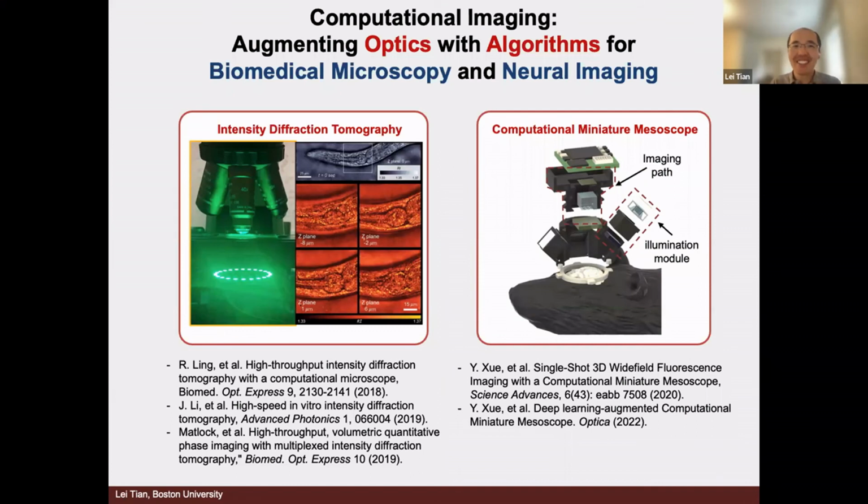Okay? So you don't see patterns anymore. We are trying to figure out how to maintain the high contrast features at the brain surface. So this is still a work in progress. This is also confounded by the fact that we're going from 45 degrees, so it's a little bit tricky. But we're certainly looking into solutions like that.